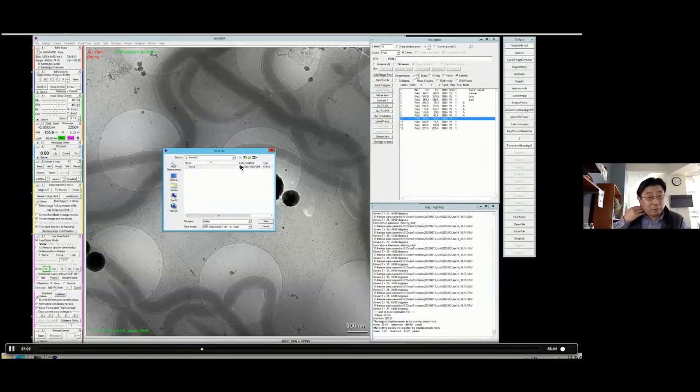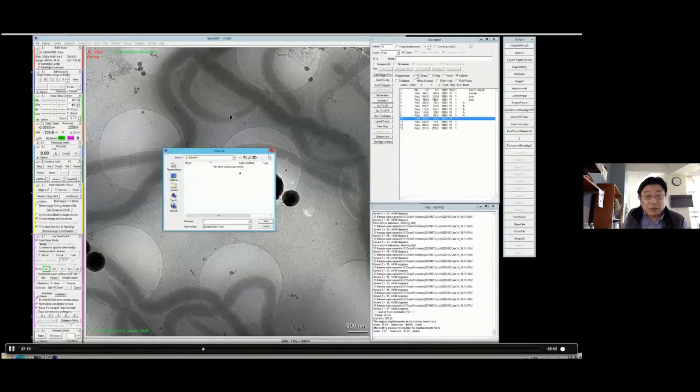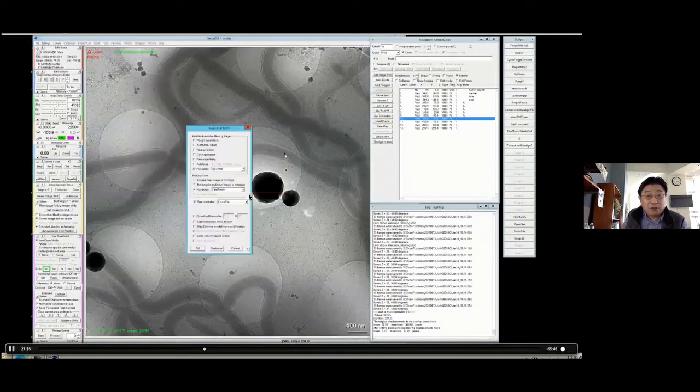This is probably the most important montage you want to make because this is the montage where you want to have a good image contrast. One of the people asked me earlier today how to select the area. This is why you need to make sure this view has very good contrast, so you know where to collect the data. Basically, this view has to be good enough to help you define which hole, which exact location you want to collect data. And so I give a name.